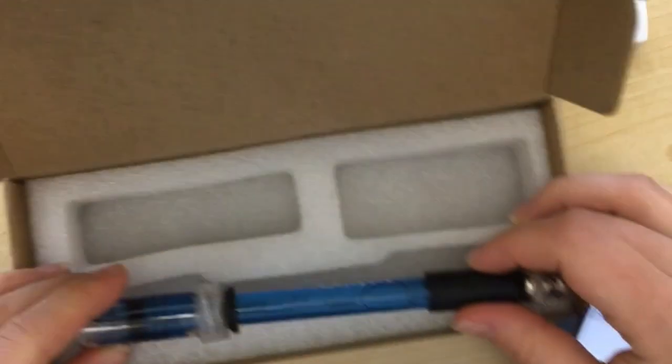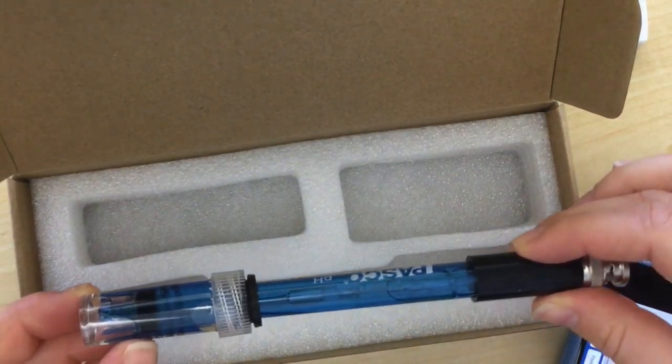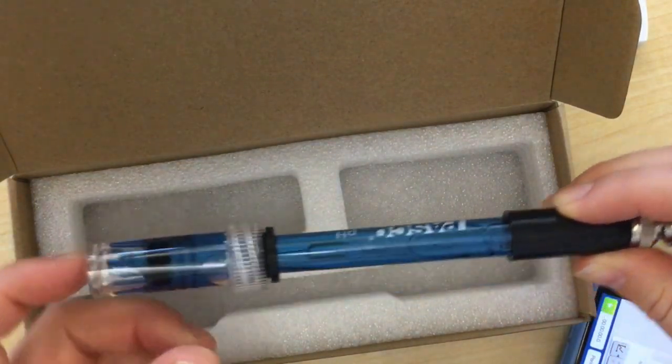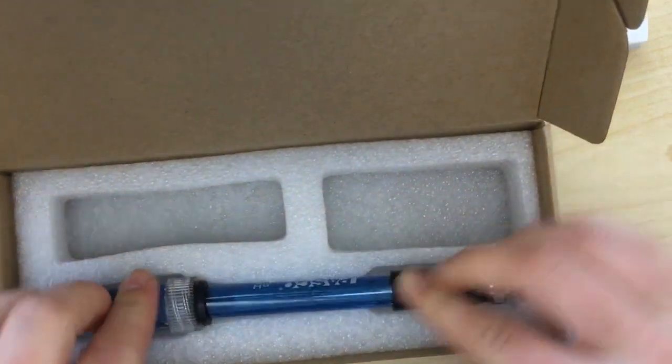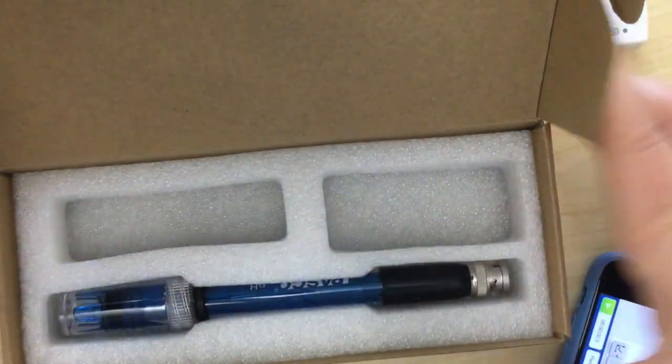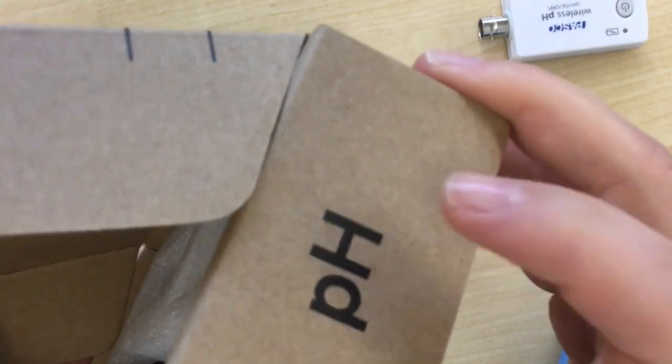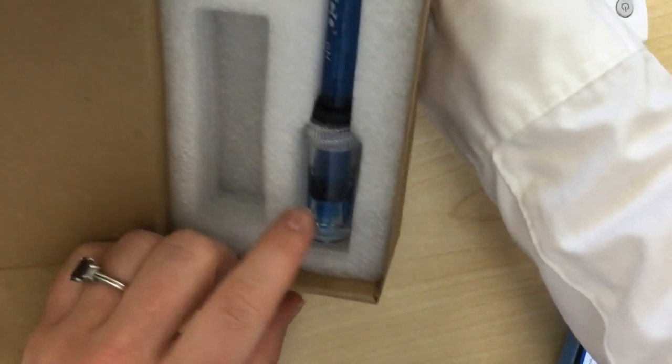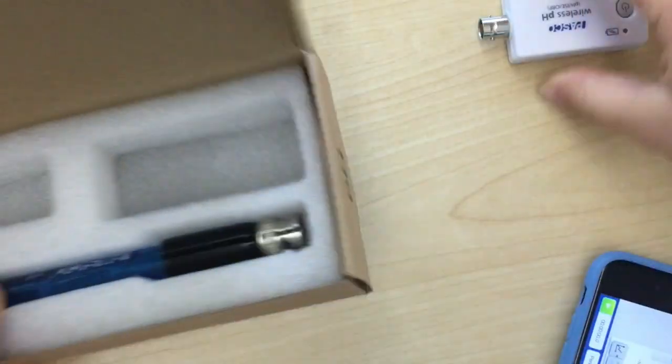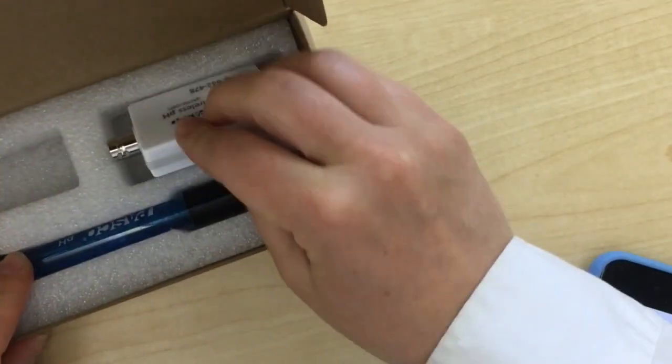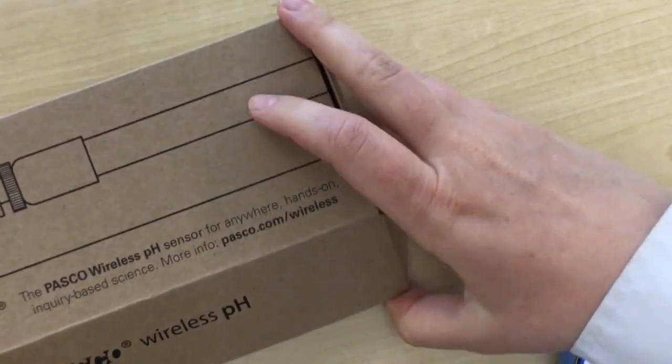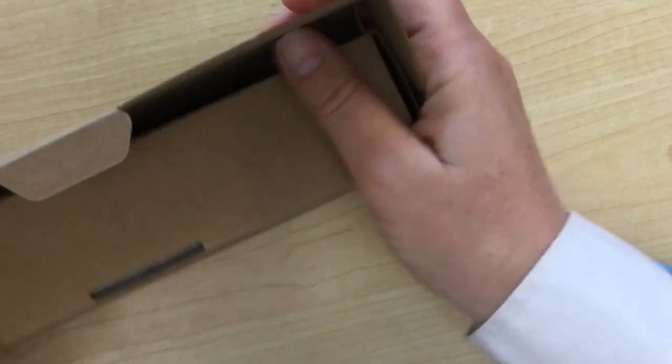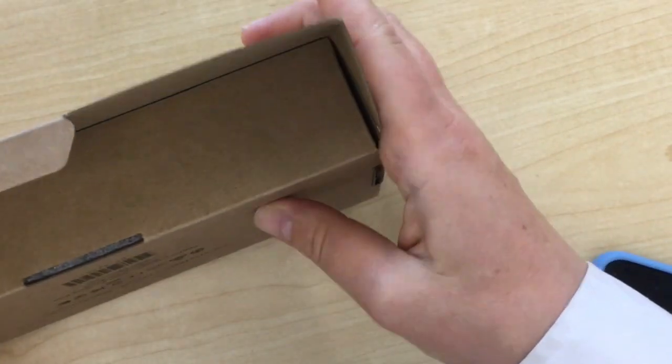When you put it back into the box, make sure you put it back in with the buffer solution towards the left, so that the pH on top makes it so that this sits in the buffer solution when it's standing upright. That is for storage purposes, and then it's all finished.